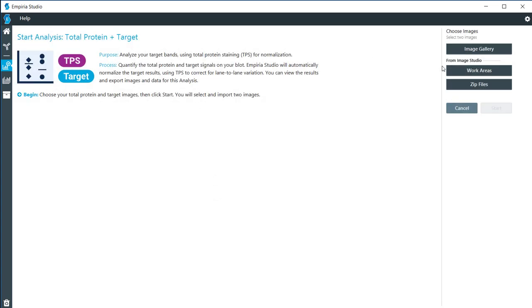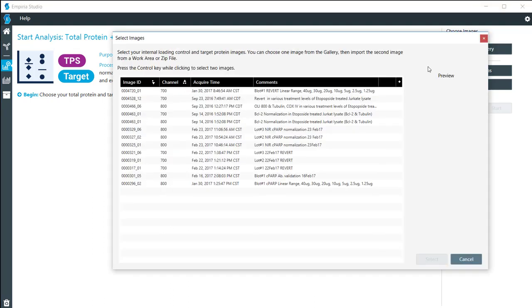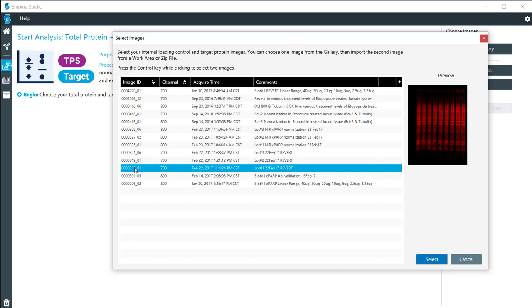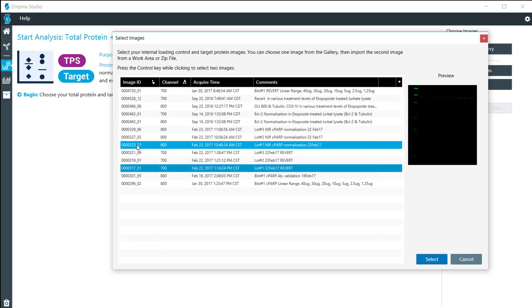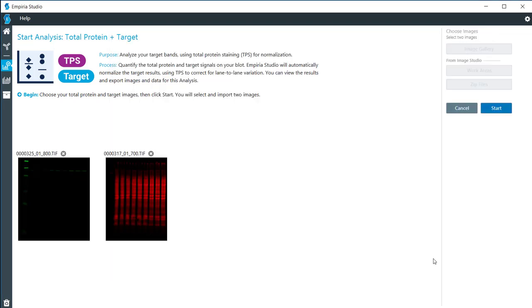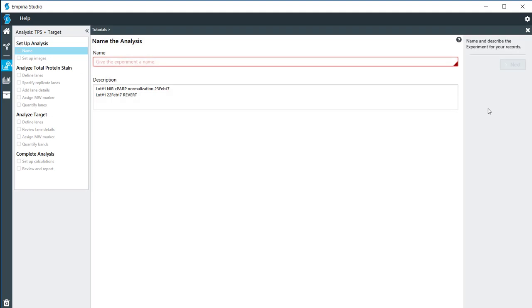As with the other videos, I'm going to go into the Image Gallery and pull out the images that I need for this. You can also, if you need to, go directly into a work area or go to ZIP files that you have exported out of Image Studio. I have my two images right here, so I'm going to go ahead and click Start.